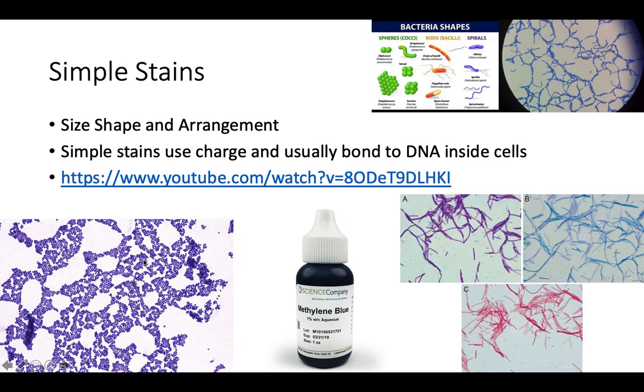Are these gram-positive cocci? I assume so. I don't know. Are they gram-negative? I also don't know. How do I know that I don't know? Because it's a simple stain. Everything that I stained is going to come out the same color. If they're gram positive or gram negative, it does not matter. So I don't know if these are gram positive or gram negative. I just know that they're cocci. So it tells me their shape. It also will tell me their size.